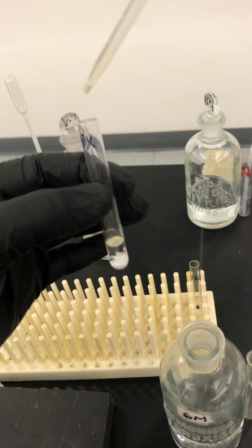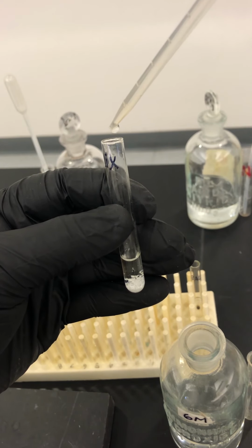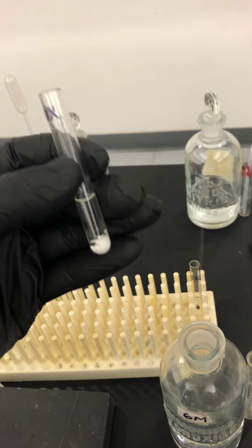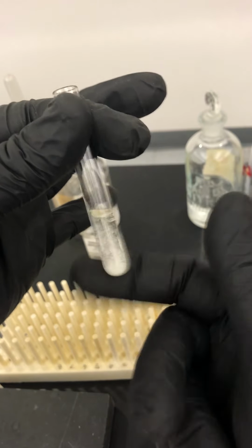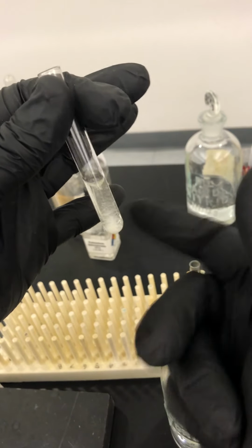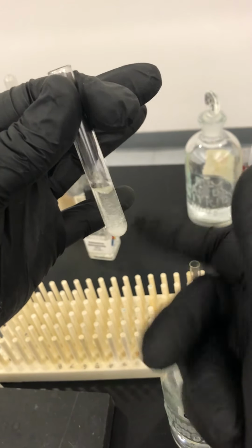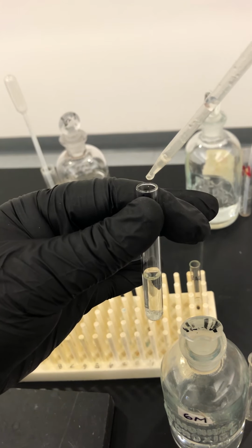Now I'm going to mix it. I'm going to add some more because I forgot that what I had was a suspension already.